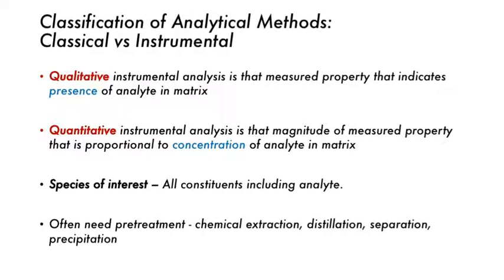So, some differences. Qualitative tends to tell us what is actually present, like what molecule or species it is. Quantitative is generally just looking at how much of something there is. It doesn't really tell us enough detail to accurately say if it is molecule X or molecule Y. Some techniques combine both. For example, infrared spectroscopy can be used for both qualitative and quantitative. However, usually even then, they end up being better at one than the other. And that's the case with infrared spectroscopy.